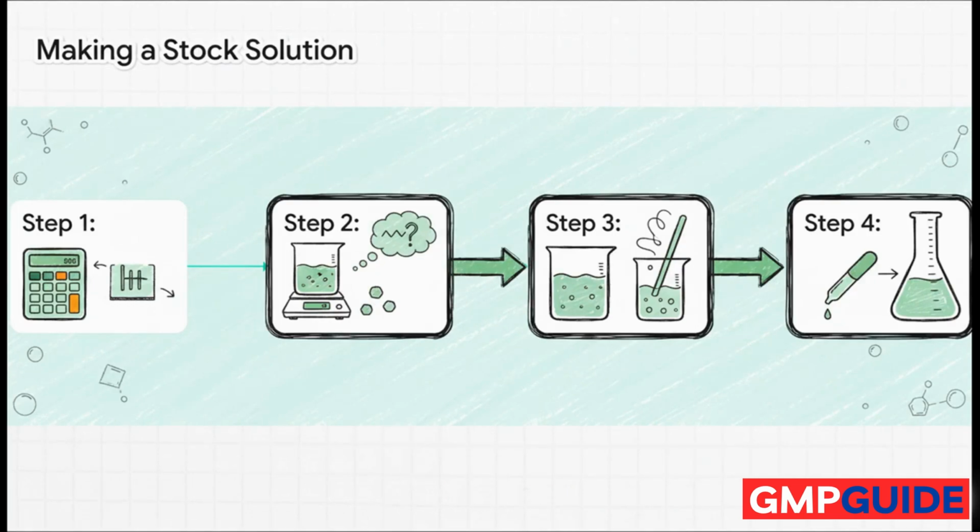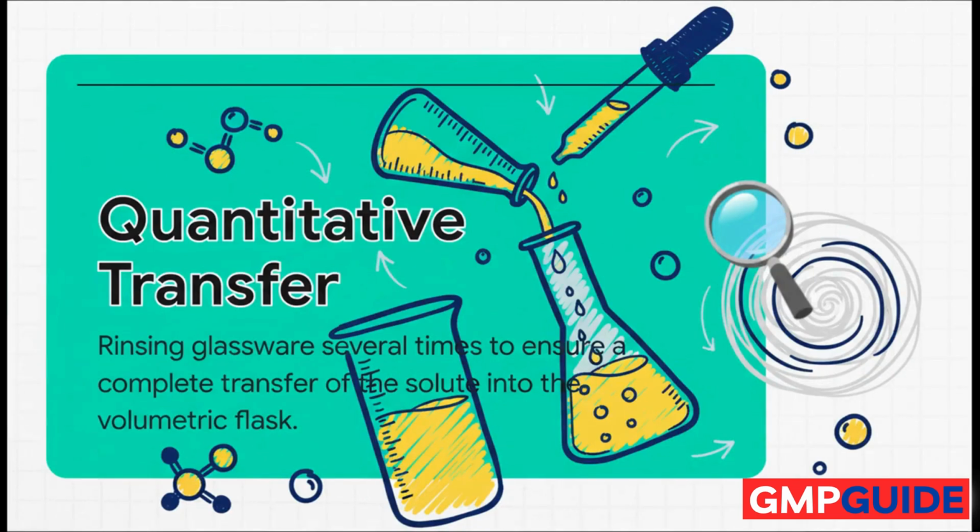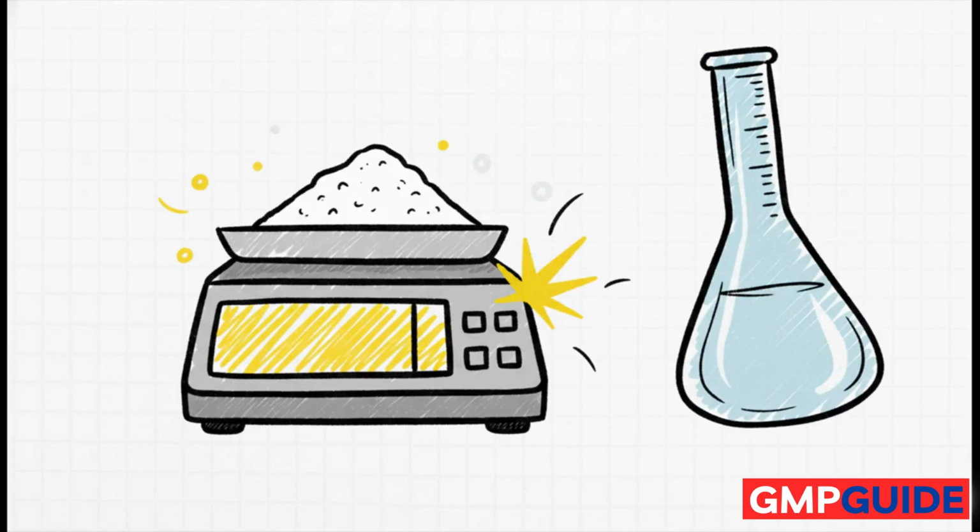Every step is crucial. A key part of this is the quantitative transfer. You've got to make sure nothing gets left behind. So for this solution, you need exactly 10.44 grams. No rounding, exactness is everything.